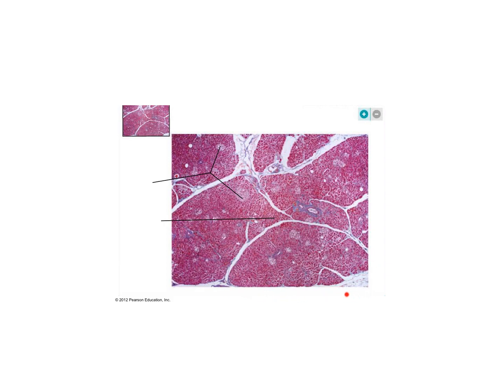Most of the cells located in the pancreas are exocrine cells, and they produce a secretion into a duct. All these darker colored cells are called acinar cells, A-C-I-N-A-R cells, and they produce digestive enzymes like pancreatic amylase, pancreatic lipase, pancreatic nuclease, so on and so forth. They are digestive enzymes that enter the duodenum through the pancreatic duct.